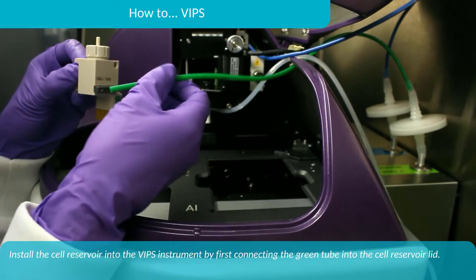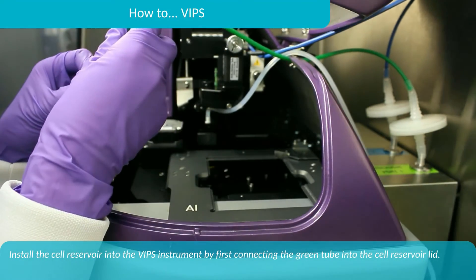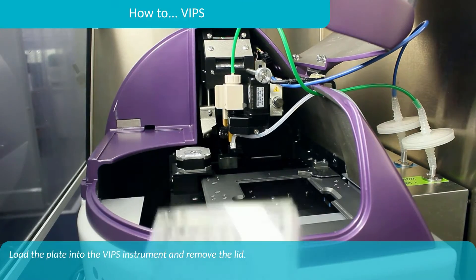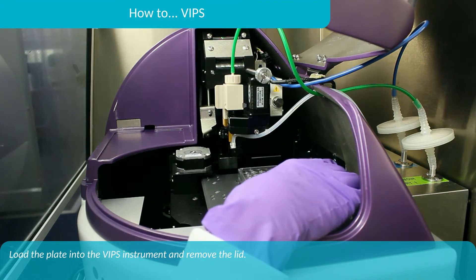Install the cell reservoir into the VIPS instrument by first connecting the green tubing to the cell reservoir lid. Then load the plate into the VIPS instrument and remove the lid.